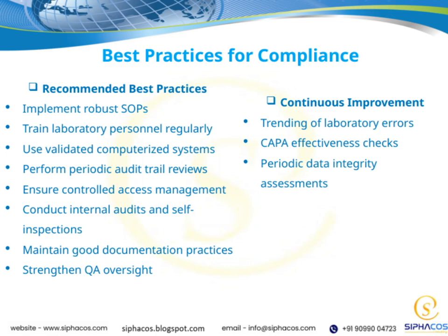This ensures that the measures we put in place are actually working and preventing recurring issues. Periodic data integrity assessments are also vital. They help us verify that our data remains accurate, complete, and reliable, which is the backbone of good laboratory practice.